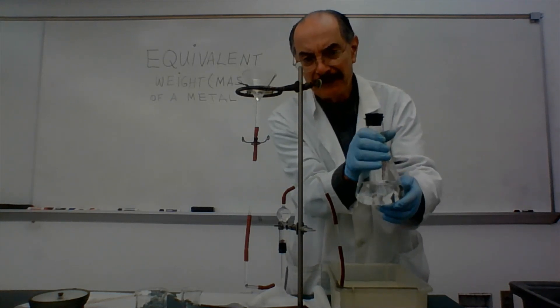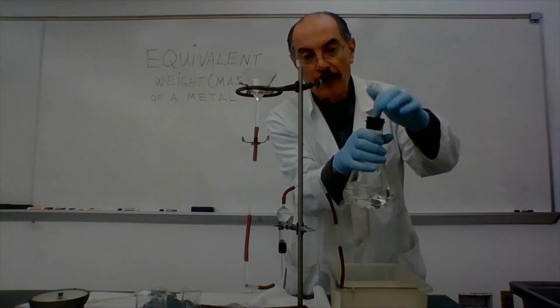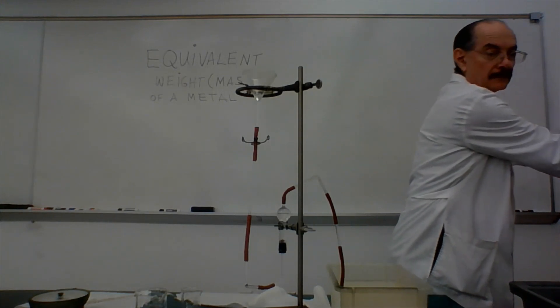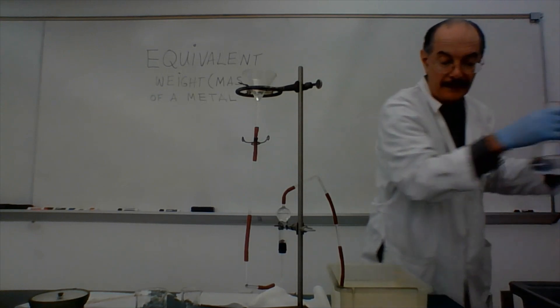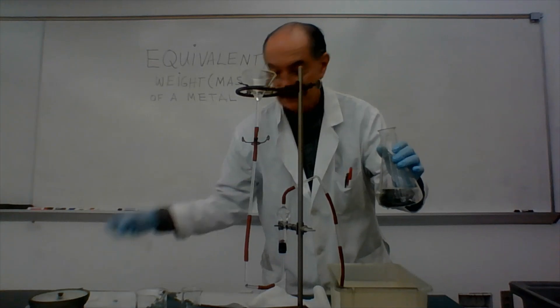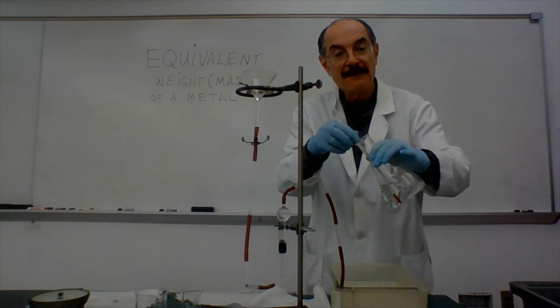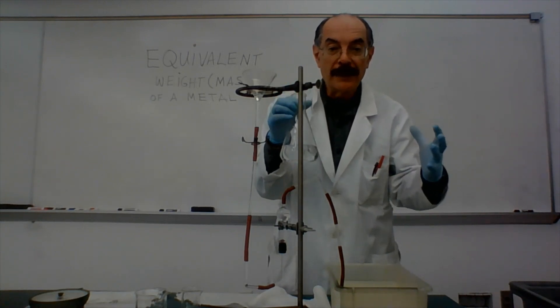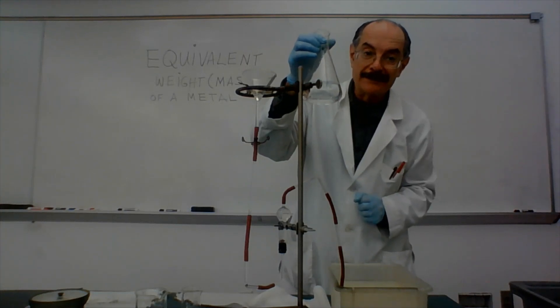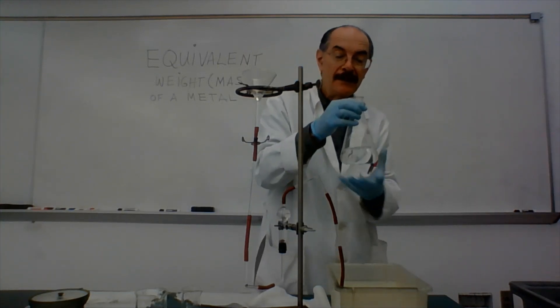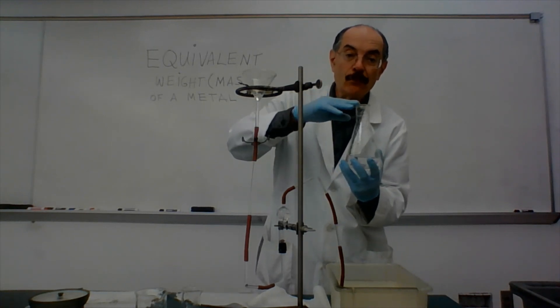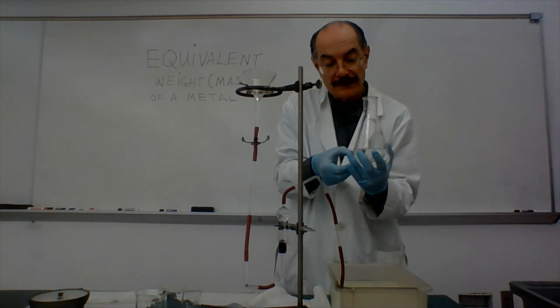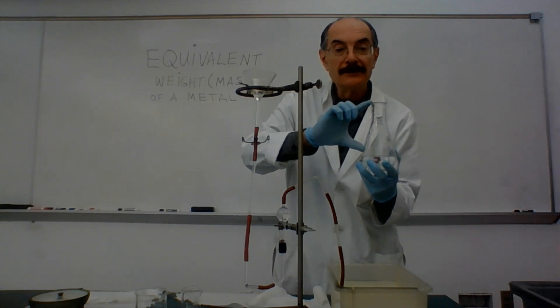At this point, because there's hydrogen here and it's flammable, I want to keep it away from sparks. So I'm going to do this in the fume hood. I'm going to open this in the fume hood. I'm going to let the hydrogen just vent out. And now I'm ready. What I'm going to do is I'm going to bring my thermometer. I'm going to take the temperature of the water in here because it should be the same as the temperature that the hydrogen had before. And the next thing I'm going to do is I'm going to take a graduated cylinder, one of the large ones, and I'm going to measure the volume of water in there. And then what I'm going to do is I'm going to go back to the sink. I'm going to fill up the flask and I'm going to read what is the volume of that. The difference between the total volume that the flask has as its capacity and the volume of water that was left in here, that would be the volume that the hydrogen gas was occupying.